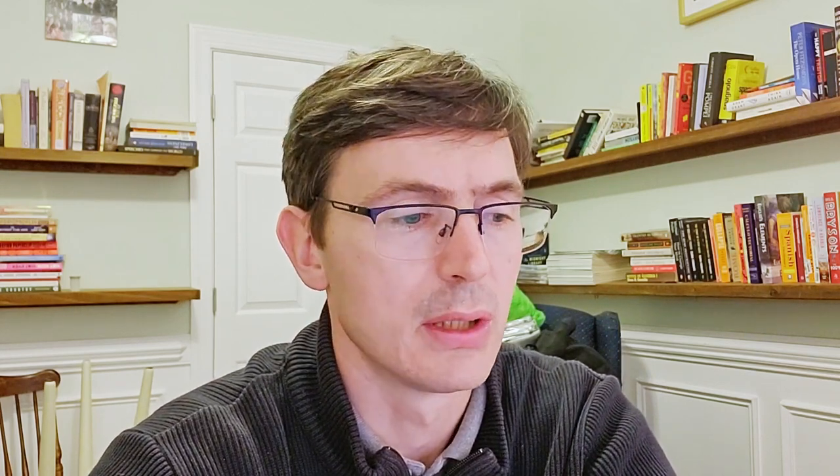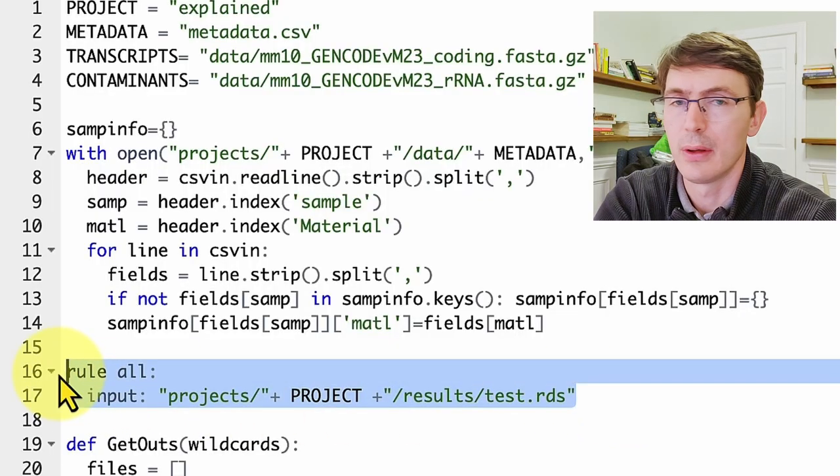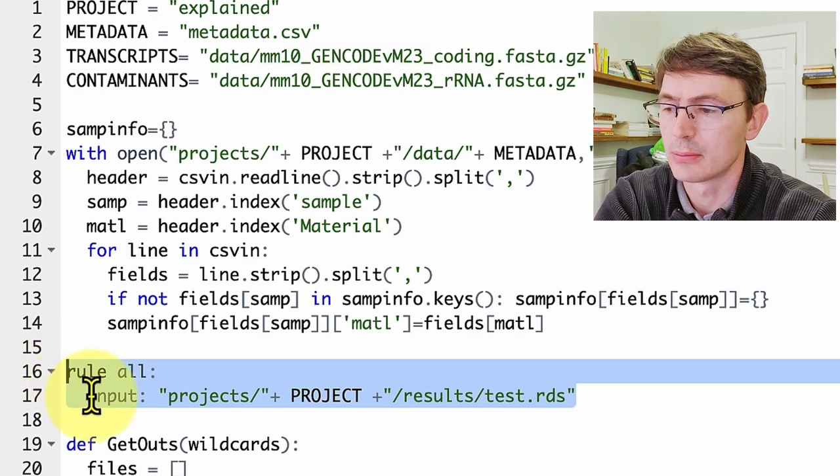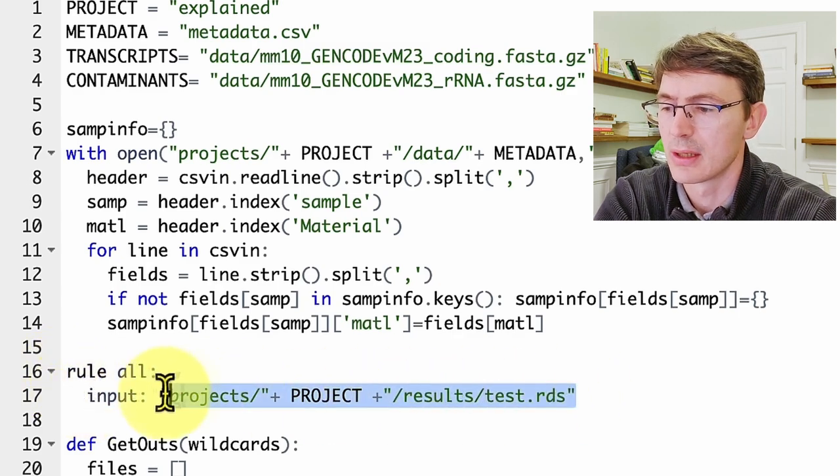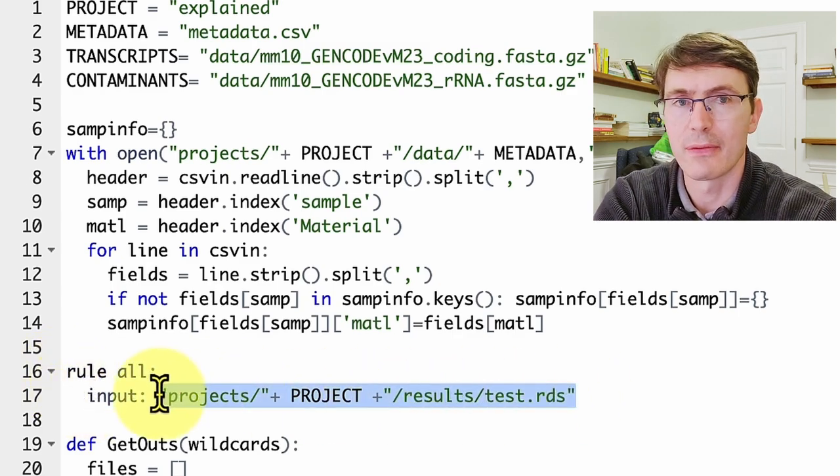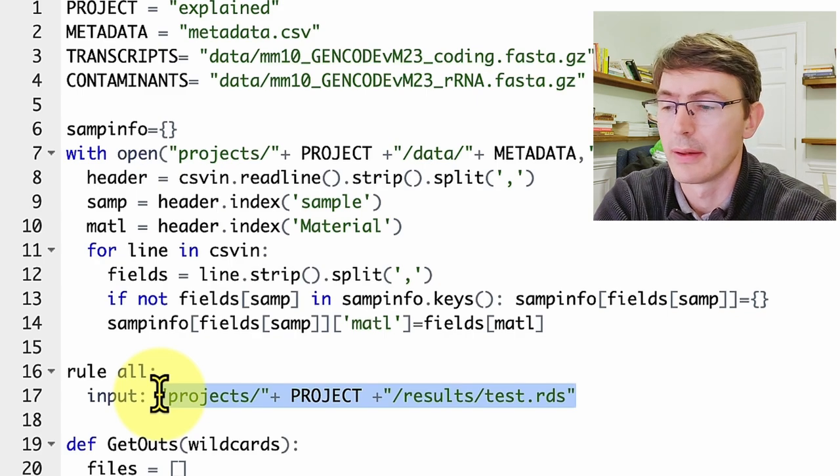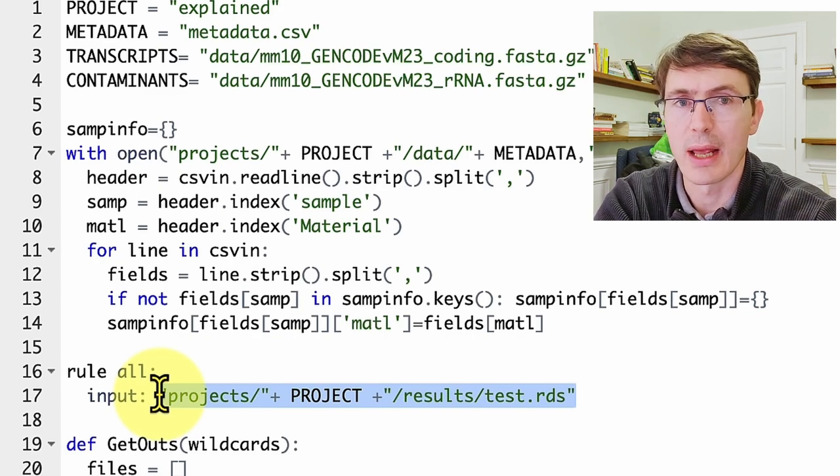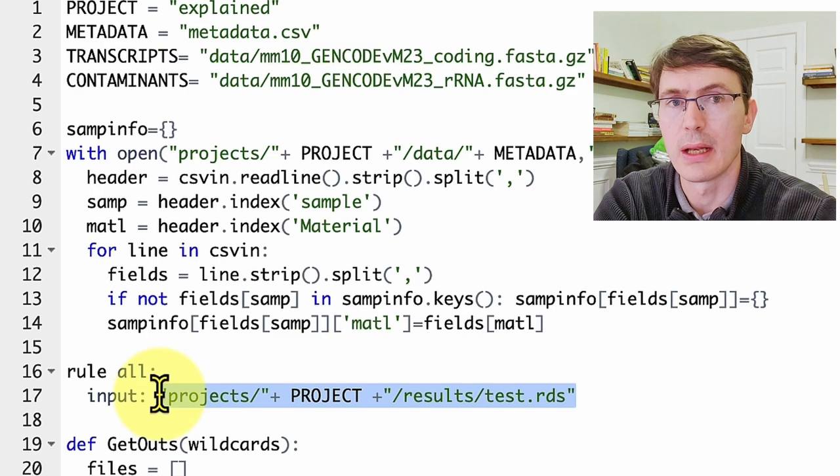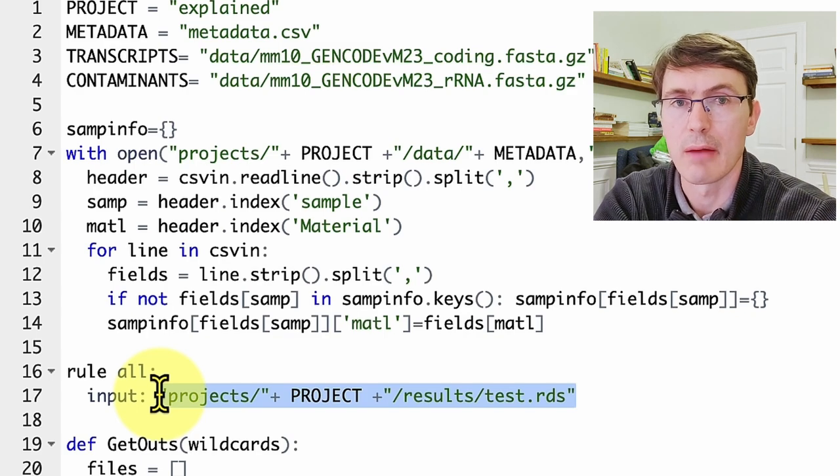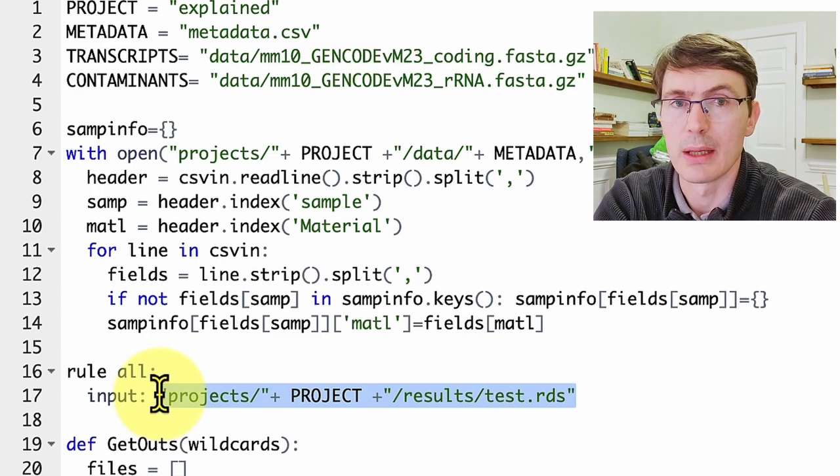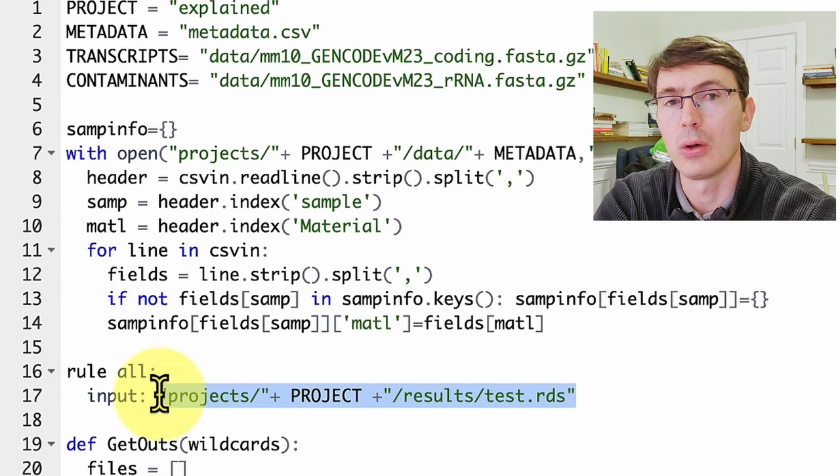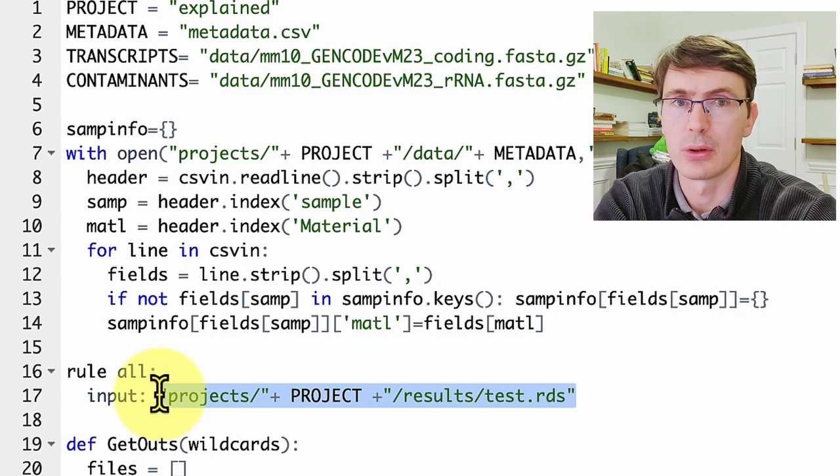So after defining that dictionary, we start with the rules, and we have this rule all that only has an input. And this is because this is the end file that we want from the whole pipeline. This is a special rule, and I have a dedicated video with the link now here that you can click if you want to go more deep into that. But remember, this rule all is the endpoint of the pipeline.